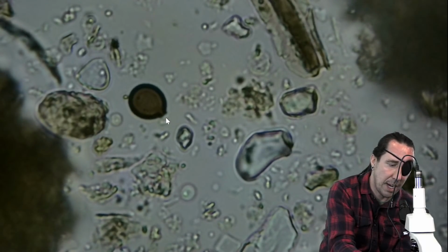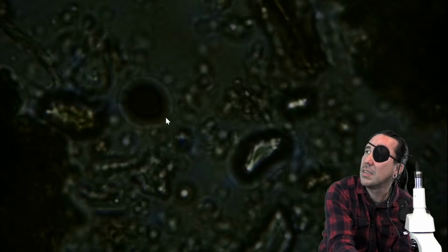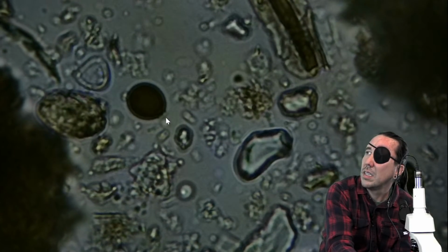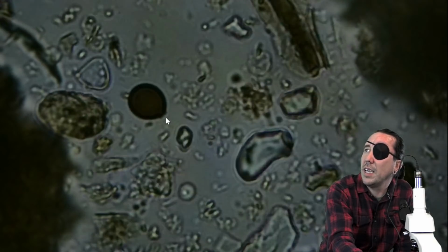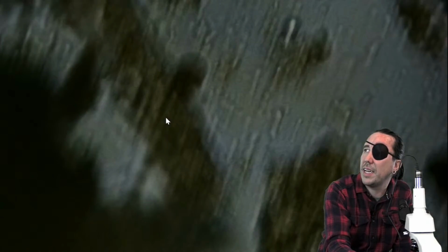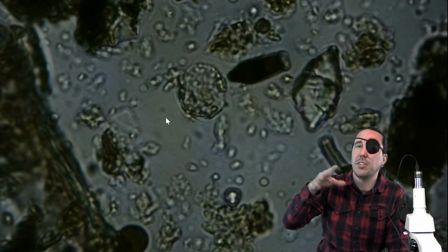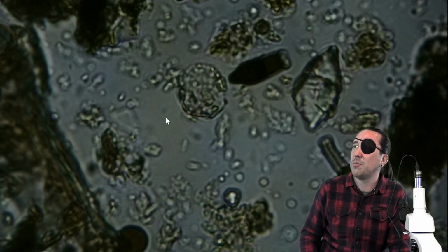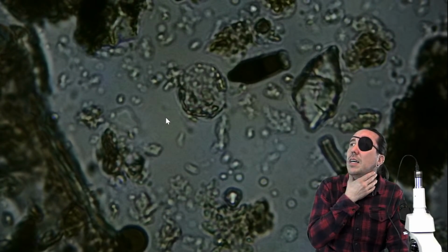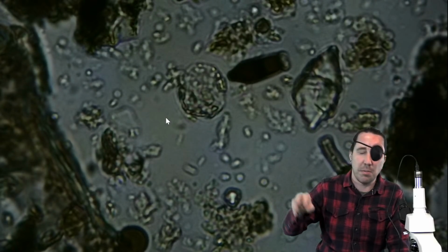And then I'm going to shadow a little bit and see if we can see any flagellates. I don't think there's any flagellates in there. Usually across the slide you'll have good averages. You might stop at one and have so many flagellates, and you'll go to another field of view and have so many flagellates. But sometimes you might not see any, and then you'll get to one corner of the sample, and for some reason there's some type of food source there and there's just a bunch buzzing around.